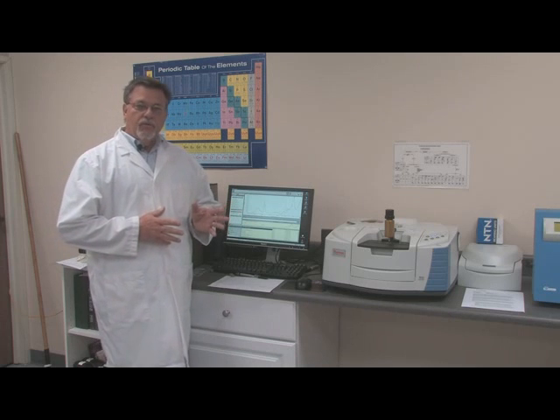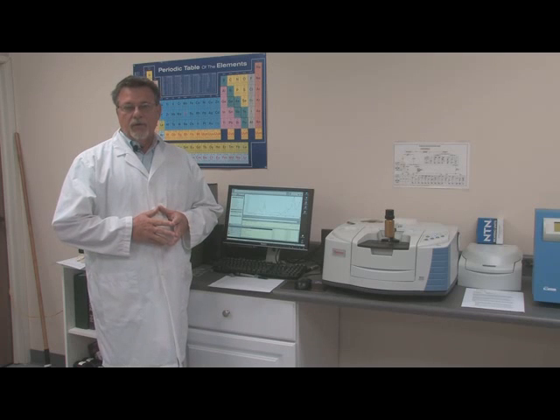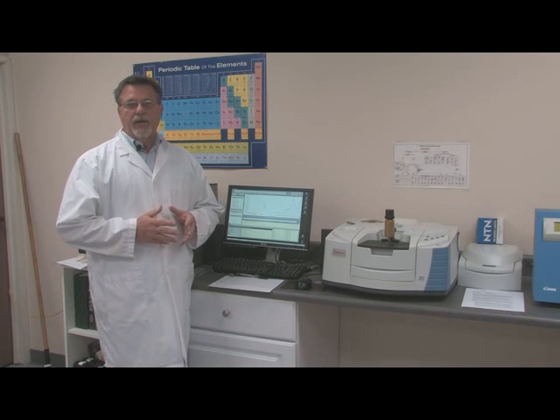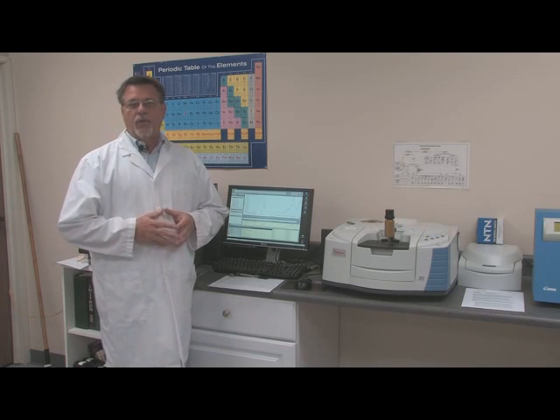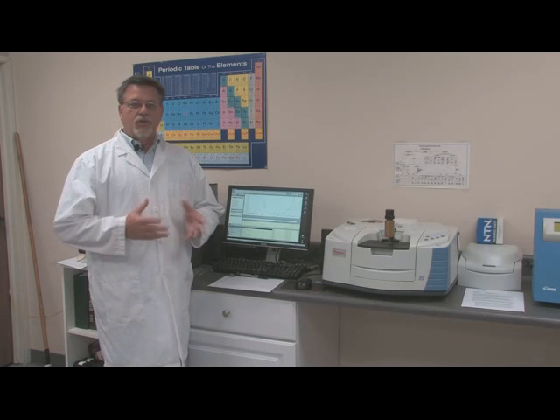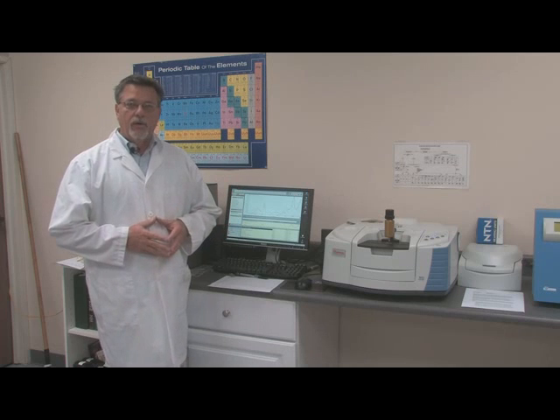This device is also very useful in terms of looking at new materials that we're developing, for instance. We can take a look at some modifications that we might be making in a fluoropolymer and determine whether or not the additions are correct, whether the additives are correct, and also take a look and see what's going on with the PTFE.